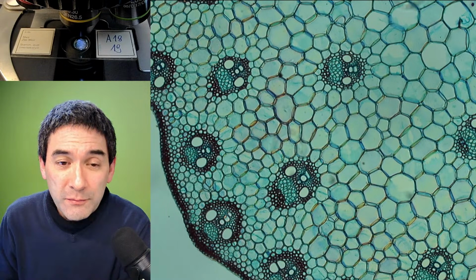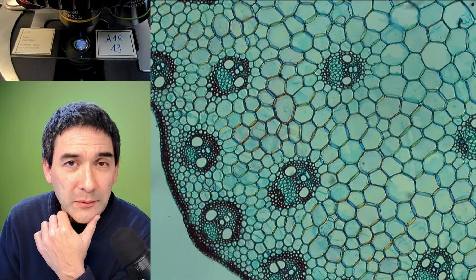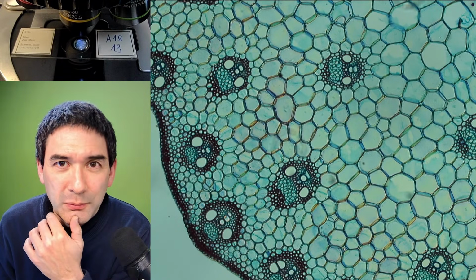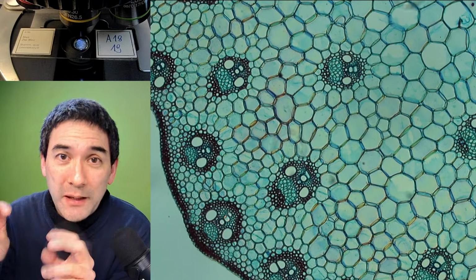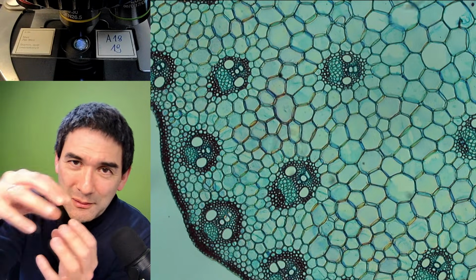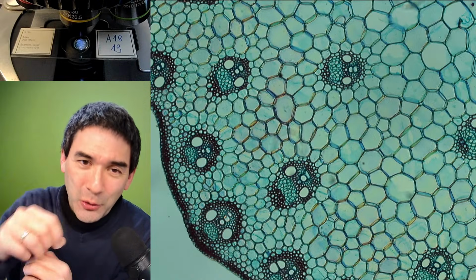This is one of my favorite ones, and I actually made one of these over 20 years ago now, 25 years ago. It was my first microscope. I made my own microscope camera using a webcam. I disassembled a webcam, constructed a separate container, and put it on my microscope.